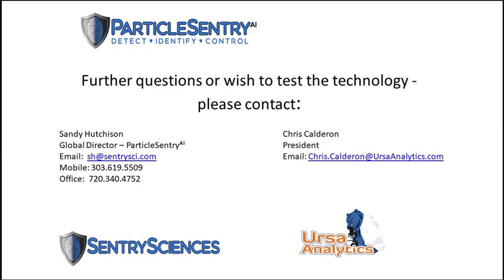Okay. Our next question, sorry, I'm sorting through the questions here, is from SP. Can the software be used with MFI images? What's your experience in terms of correlation between similar particles across different instruments? Yeah, that's a great question. So the measurement modality, these things are very sensitive to subtle features in the imaging modality. As we showed with the ETFE, just changing the focus can change the fingerprint. And so yes, this is applicable to MFI, but you can't really compare MFI images to FlowCam images on the same product.